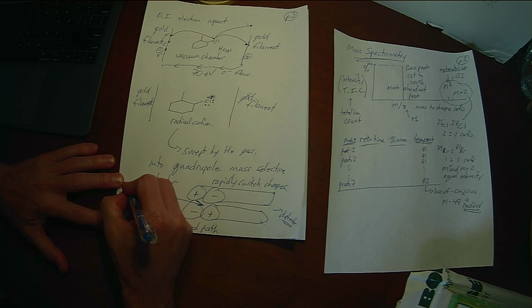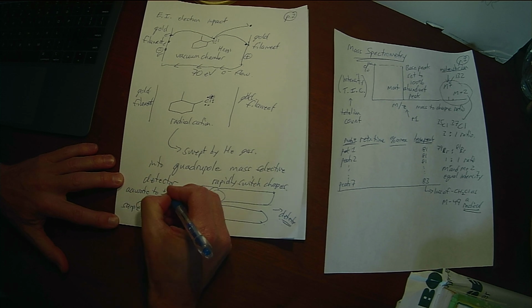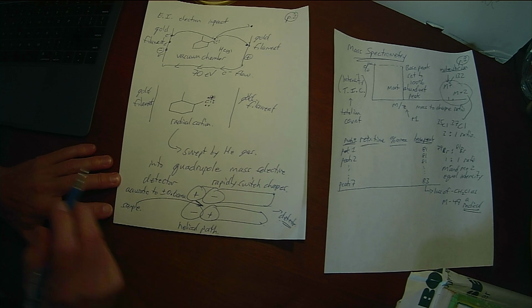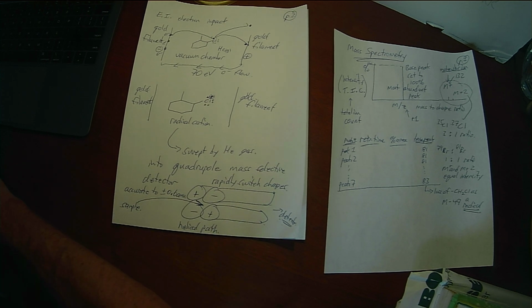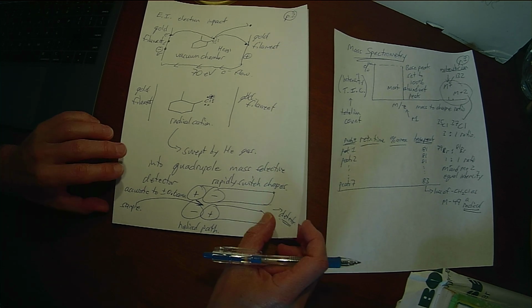It's only accurate to about plus or minus 0.6 atomic mass units. Right? So we're not able to do exact masses. We can't tell the difference between CH2, which has a formula mass of 14, and nitrogen, which has a formula mass of 14. But on the more sensitive instruments you can, because CH2 and nitrogen are both 14, but they differ in the third and fourth decimal place.